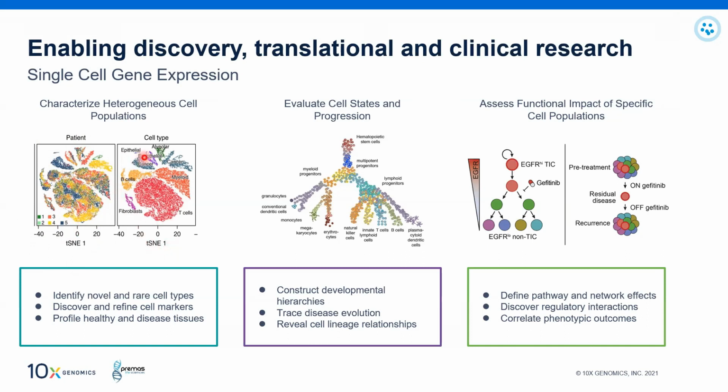And ultimately, if you see the cell type based on their function, you can say cancer one. So here is also cancer, here also cancer, and these are the myeloid population. So if you see, these two cancers are very different and coming from two different samples. So that means the heterogeneity is very huge, which is what we want to understand in any cancer sample.